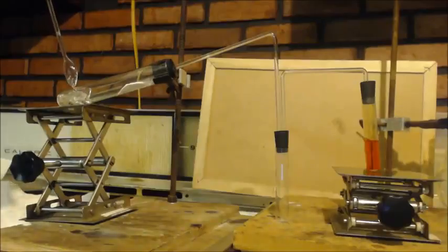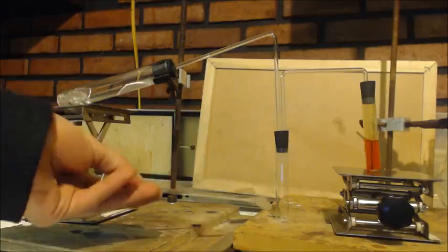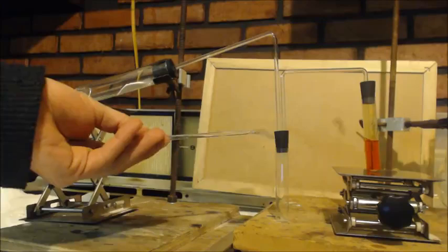I got some ethanol again in here, but I put some chunked up glass in there. I don't have any cotton or anything, but usually I'd put cotton or something in there. I don't have any, and I don't have a car right now. There's my dehydrator, the aluminum oxide. It feeds out to here to an empty container. I don't know if you can see the container. I know you can see the stopper.